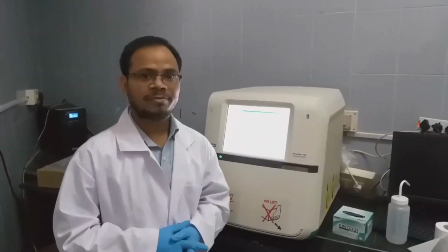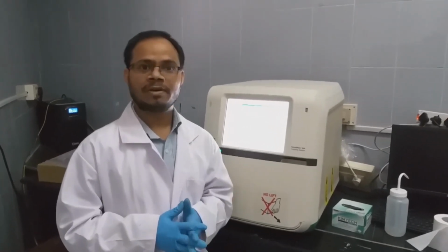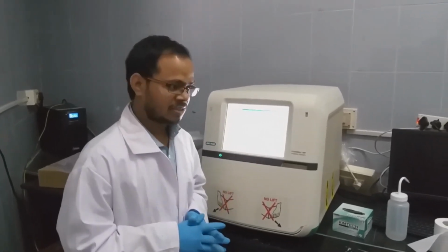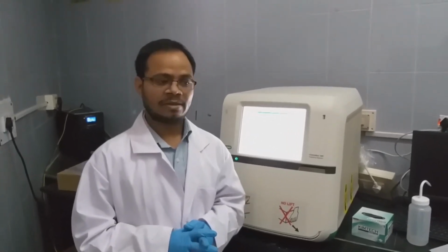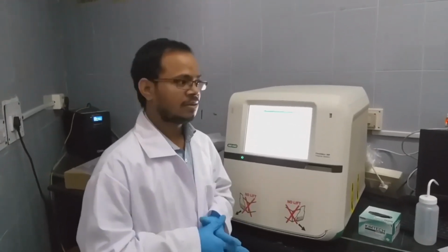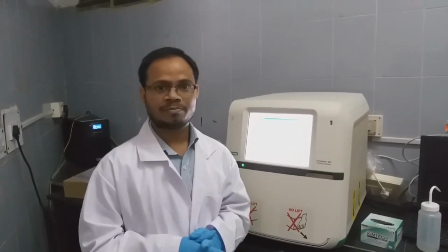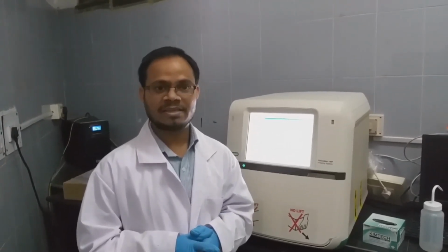In this video, we have learned how to prepare an SDS page gel and how to run it, what precautions need to be taken while preparing the gel, and how to record the gel using a gel documentation system. I hope this will give you a gist of how to prepare and run an SDS page gel and analyze the protein sample.